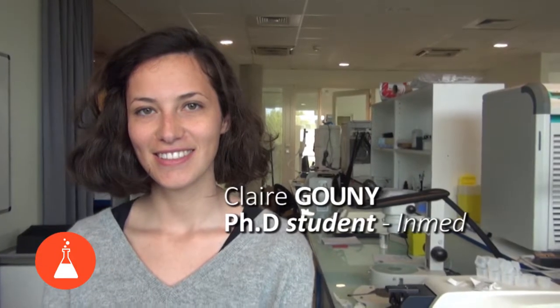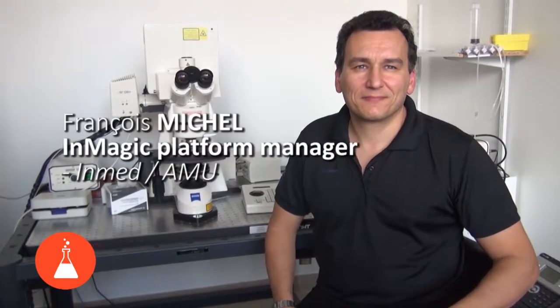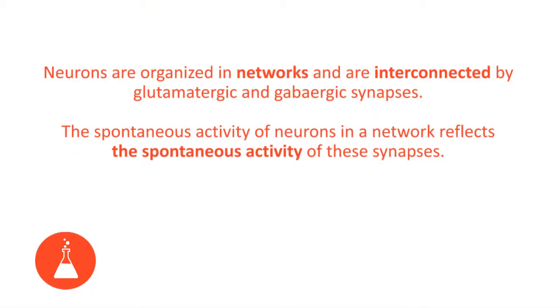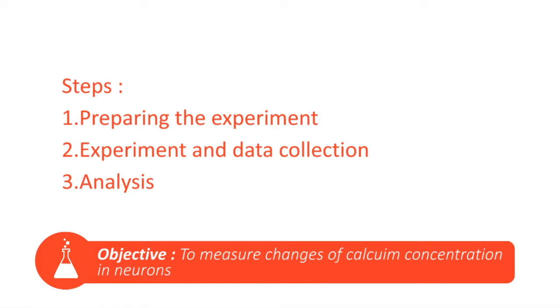Neurons are organized in networks and are interconnected by glutamatergic and GABAergic synapses. The spontaneous activity of neurons in a network reflects the spontaneous activity of these synapses. To visualize the activity of each neuron in a network, we can use calcium imaging. Why? Because changes of calcium concentration inside the soma of a neuron reflect its electrical activity.